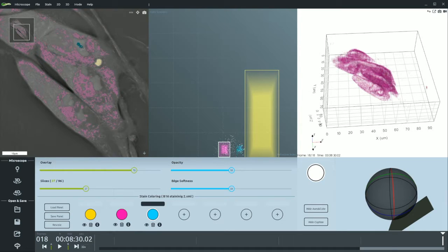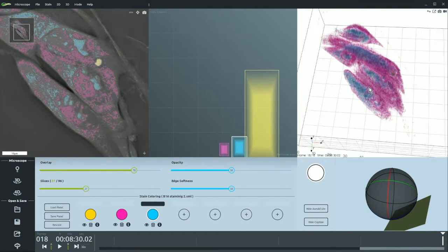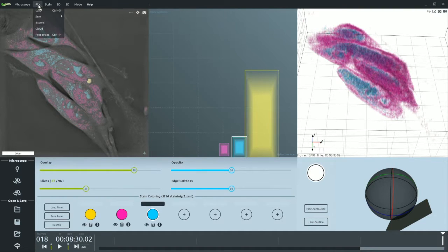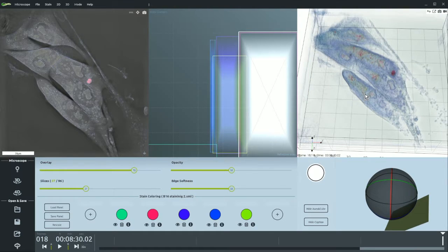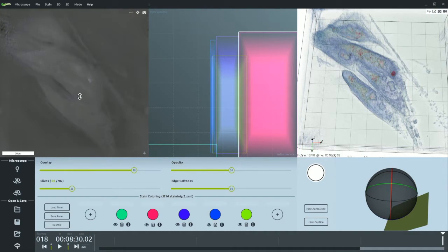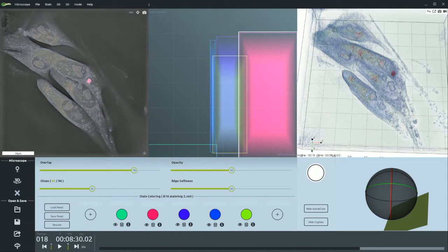I add a few more colors for several other regions — this part here, or this part here. By just a few clicks I've been able to generate a 3D reconstruction of my cells. This color-based marking based on a physical property is a real marker: you can save it, and most importantly you can apply it again. I've prepared a stain for these cells with a little more time invested, and this is how they look — you can really see all the structures very well and follow them through.